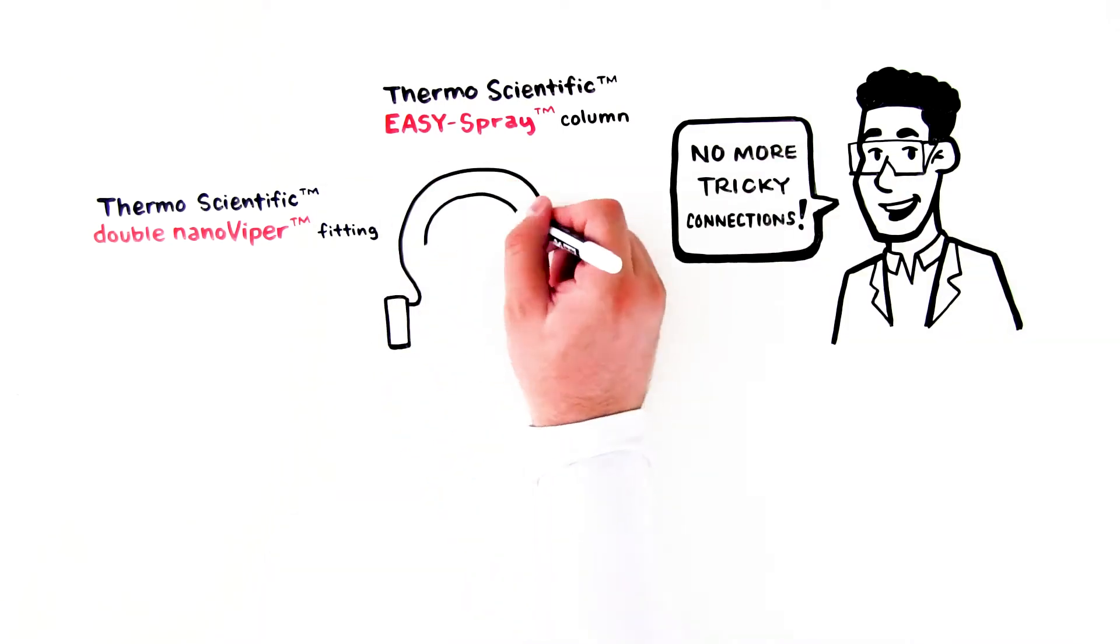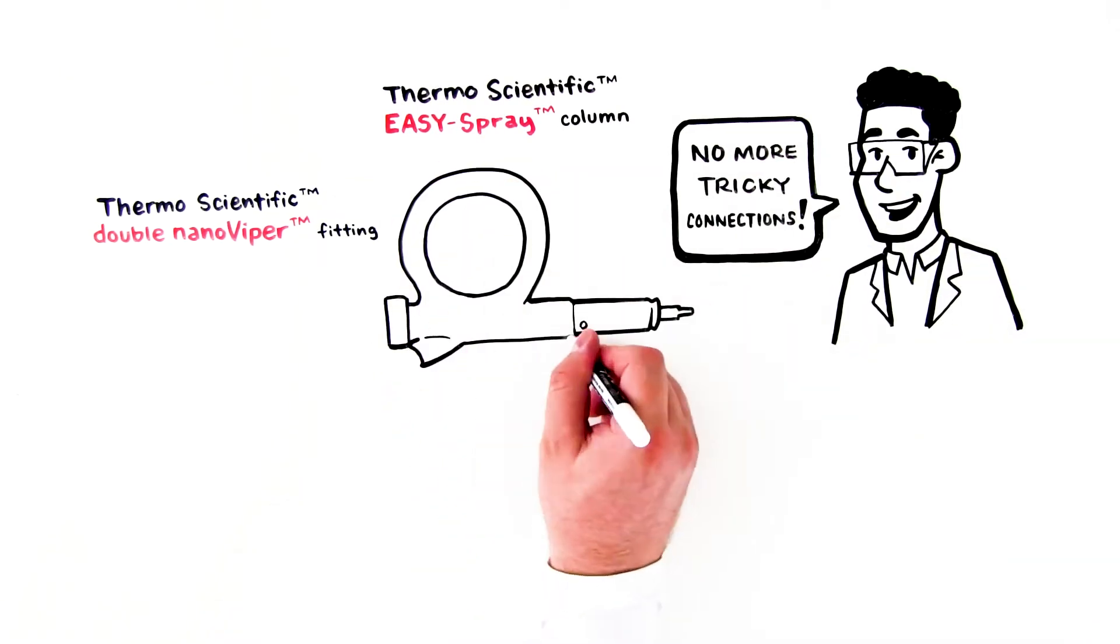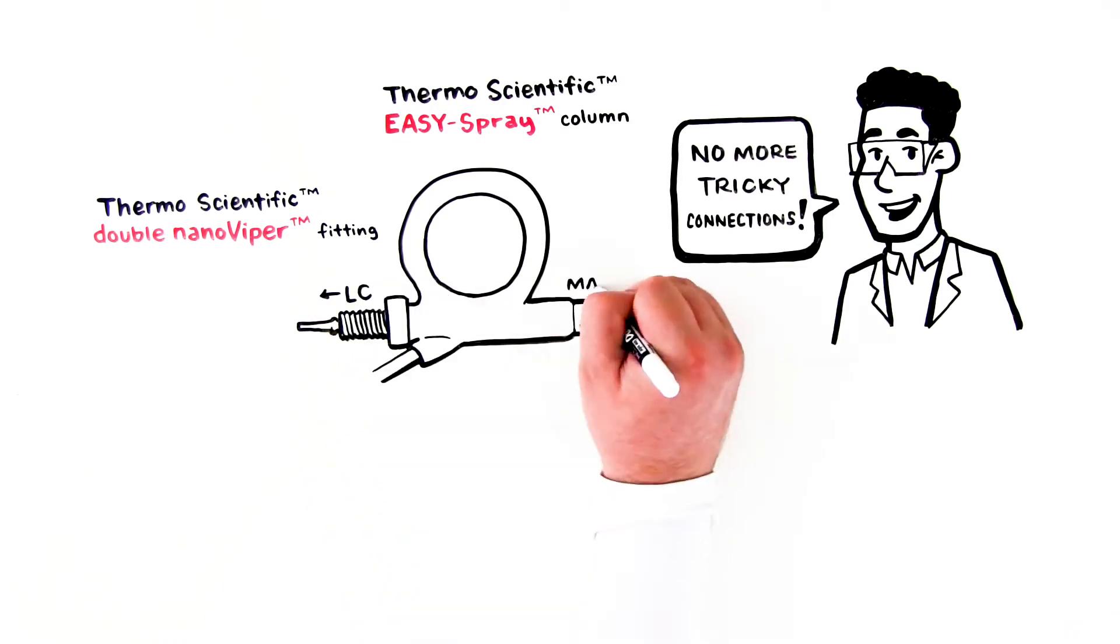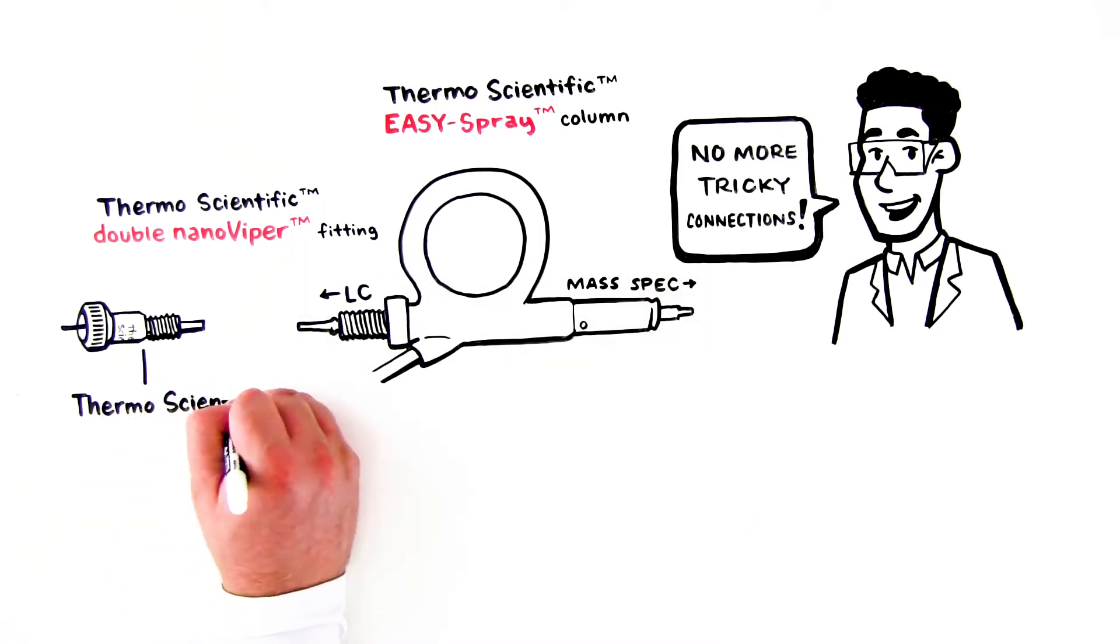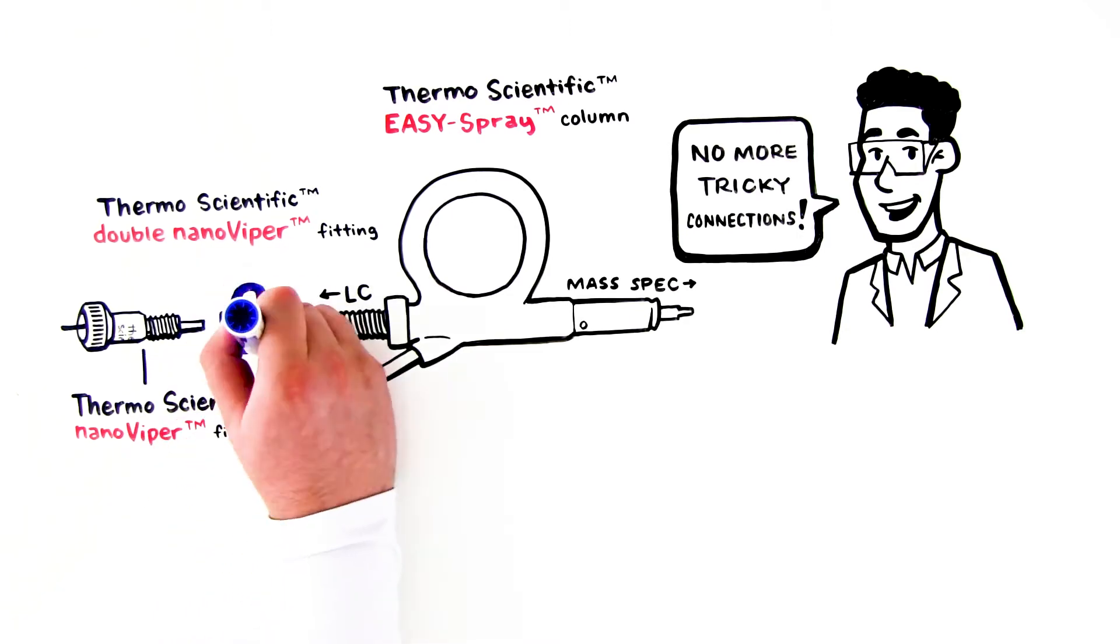The Easy Spray column has two connections – one from the LC and one to the mass spectrometer. The Thermoscientific Nano Viper fitting enables a trouble-free, secure connection from the LC to the column.